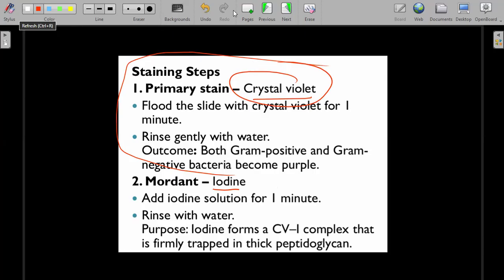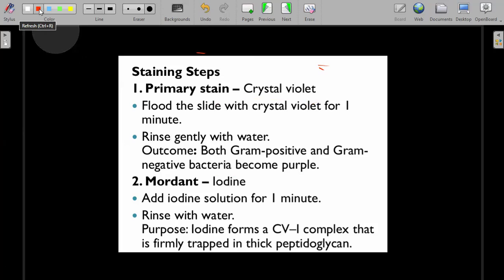Okay, so you've prepared your sample, you've heat-fixed your sample, and now you're adding crystal violet stain. I said that I'll focus on this one because it's the common one you usually use. So you put your crystal violet stain on this sample.